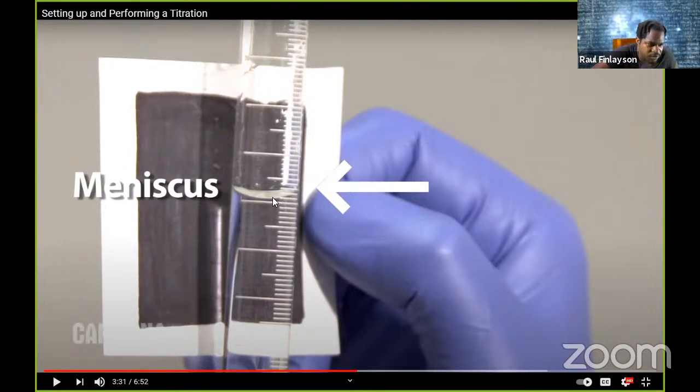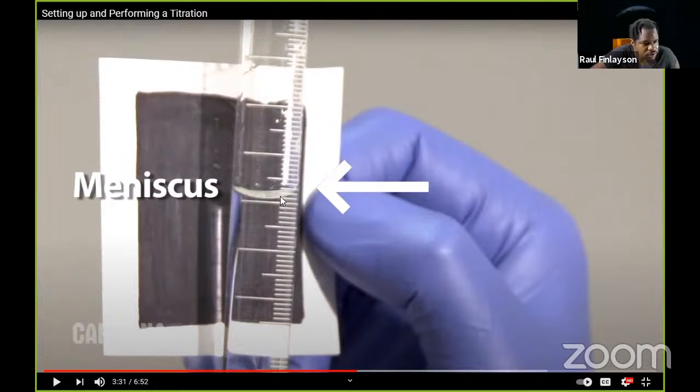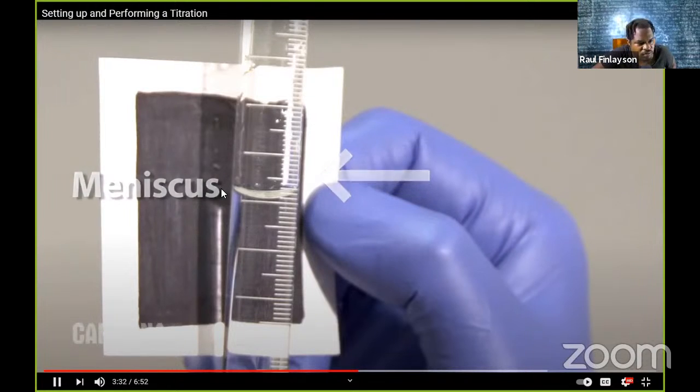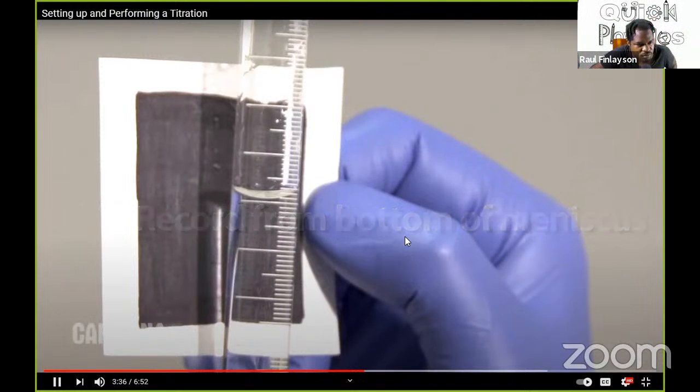Do you understand that? Yes, sir. We read below the curve of the liquid, at eye level. And as it says, use a paper here to block out the light so you can focus the reading. You should read the volume from the bottom of the meniscus at eye level.